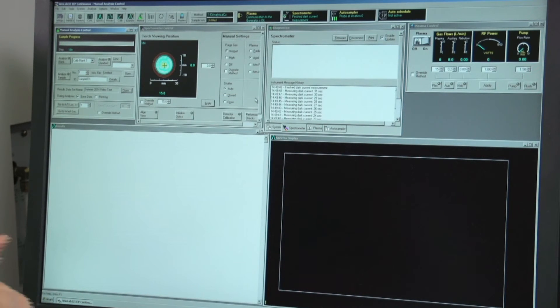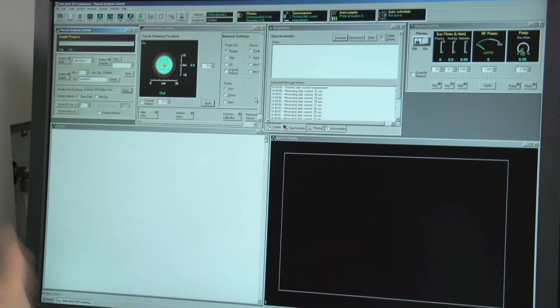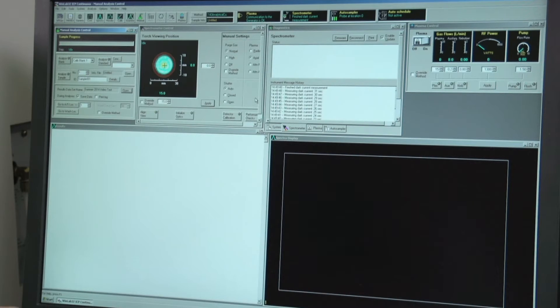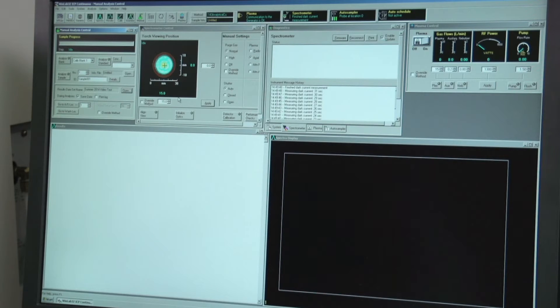The first part of the experiment is to optimize the wavelengths for copper. Since we selected all wavelengths in the method editor, the instrument will collect data at all of those wavelengths. We need to collect a blank sample first — three replicates with a 30-second delay before analysis. Insert the inlet line into the blank sample, which is the Erlenmeyer flask filled with millipore water, and then hit the analyze blank button.